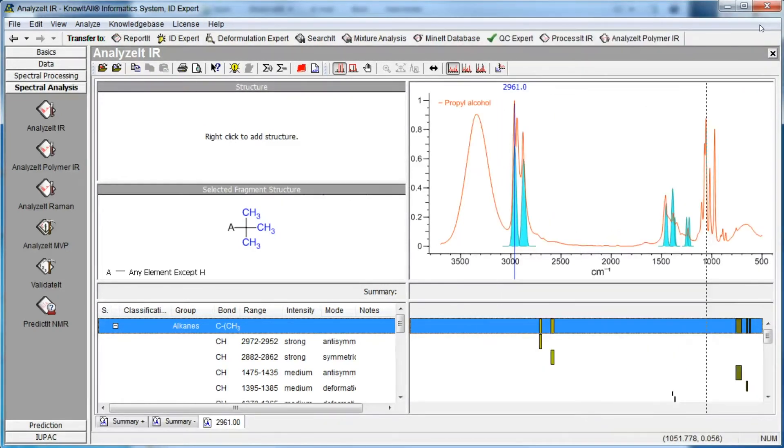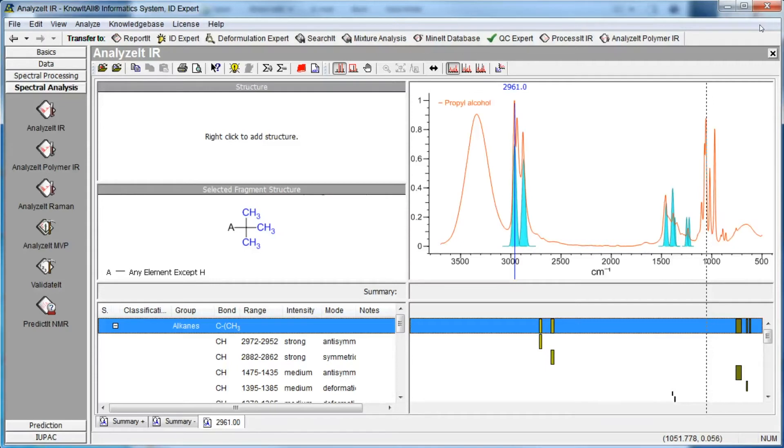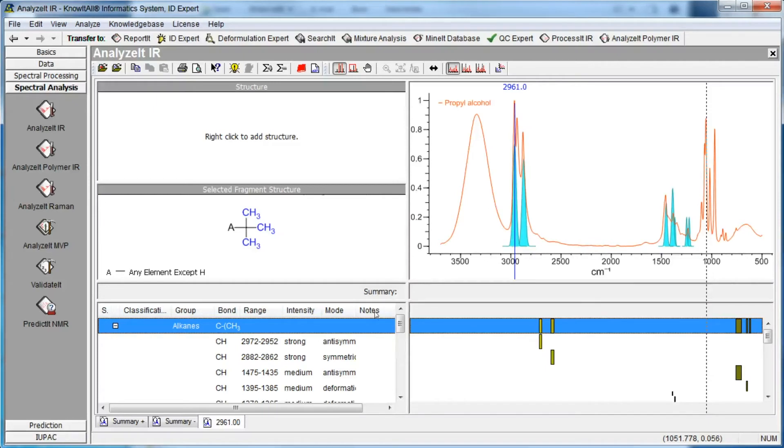The tabs at the bottom of the main window are labeled according to how the information was generated. The peak analysis is labeled with the wavenumber. The Summary Plus and Summary Minus tabs are created automatically and are provided to allow you to keep track of functional groups that are consistent with or inconsistent with the measured spectrum.